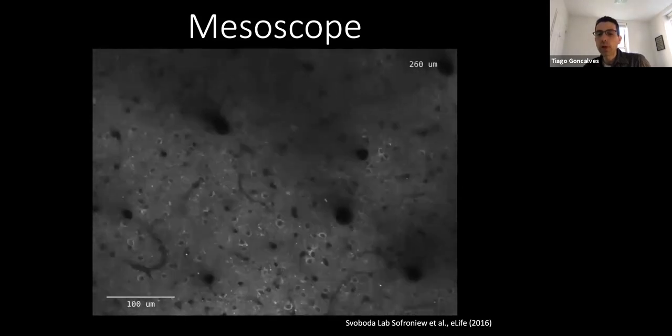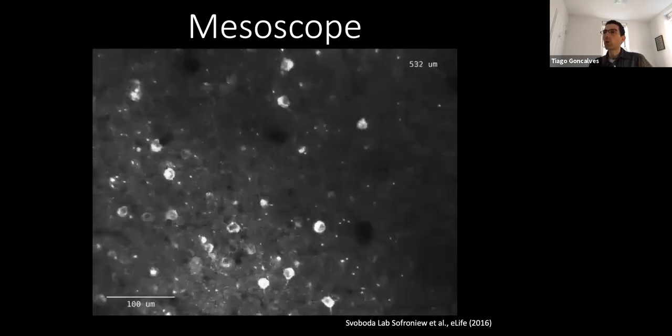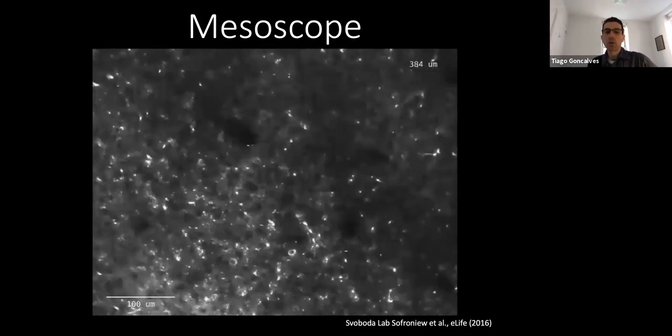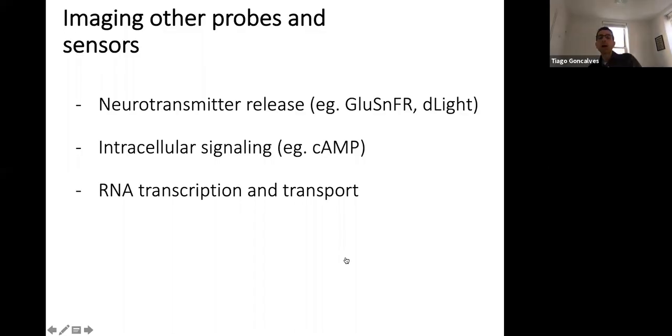This is one of the latest developments in the field, being able to do these recordings with a single objective and jump from one part of the brain to another really fast. This video is really impressive. You can look it up if you want. I don't know how well it reproduces in your Zoom.